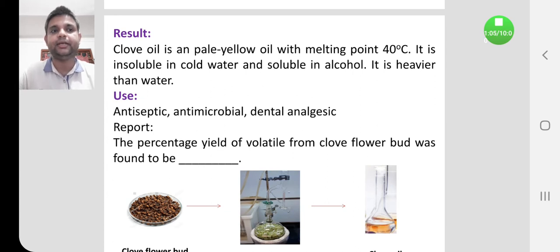It is soluble in organic solvents like alcohol. As I already mentioned, clove oil is heavier than water, so obviously it should immerse in the water.